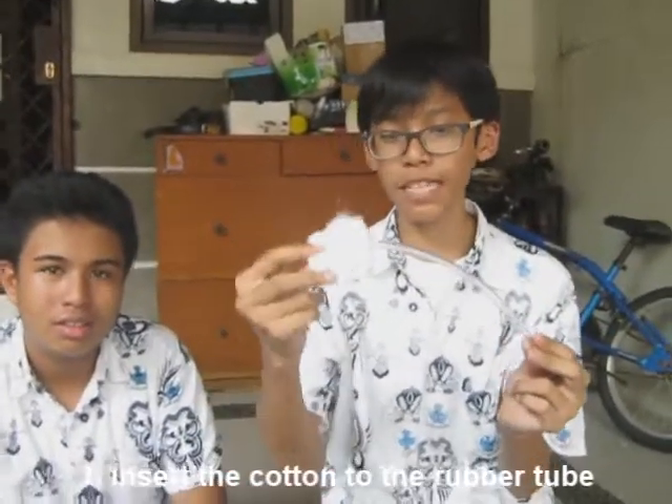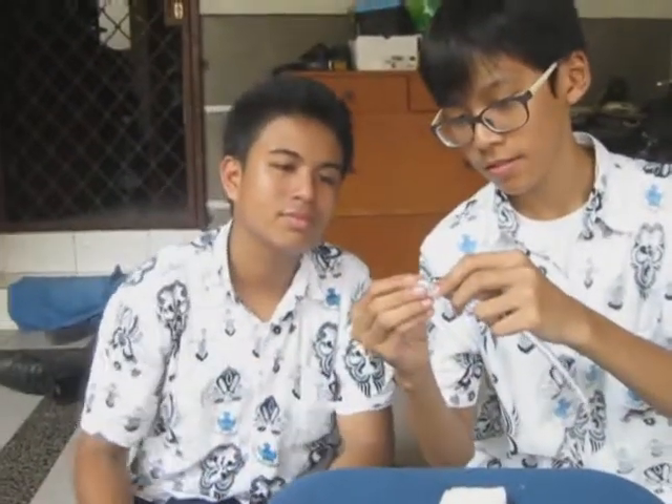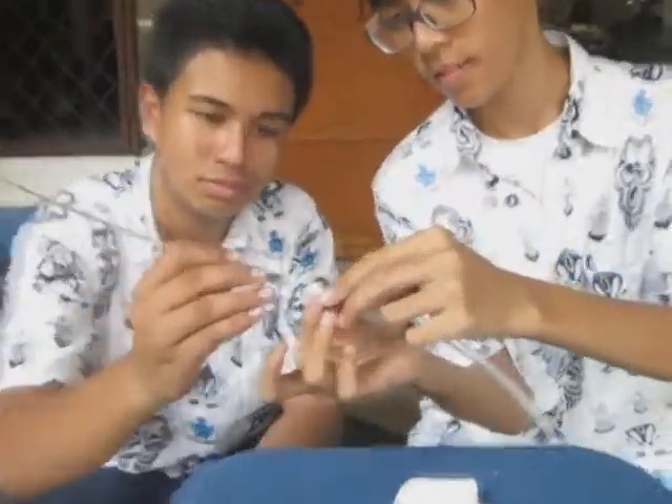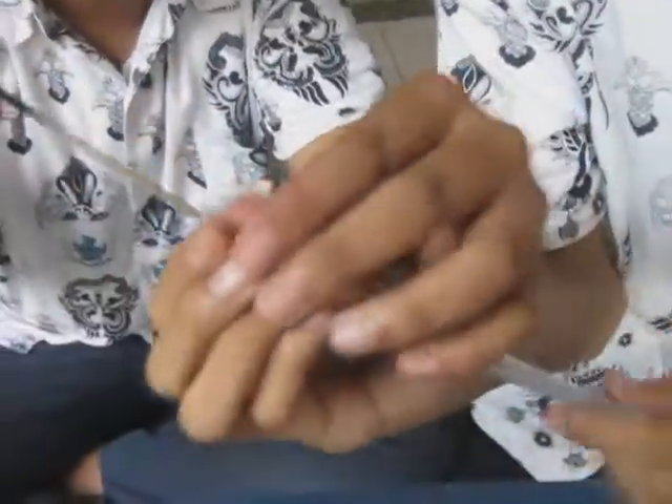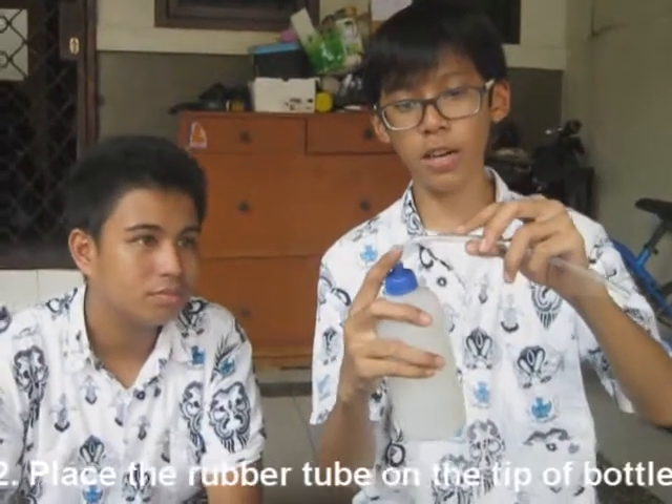And now we do the experiment. This is the rubber tube and the cotton. We have to place the cotton inside the rubber tube, in the middle of the rubber tube. And then, this is the bottle — it can be squeezed. Place it at the tip of the bottle.